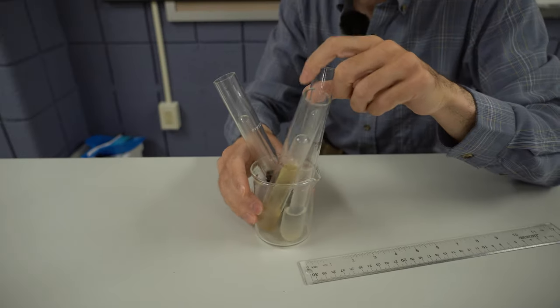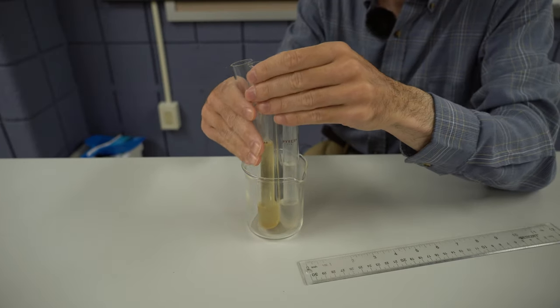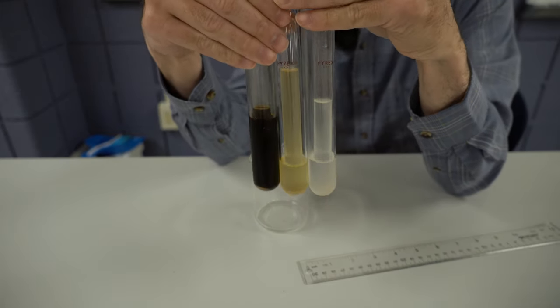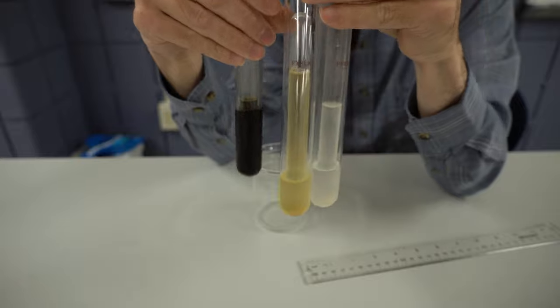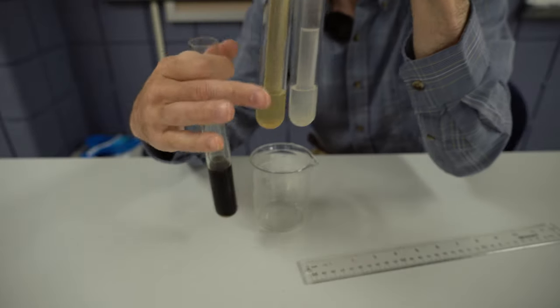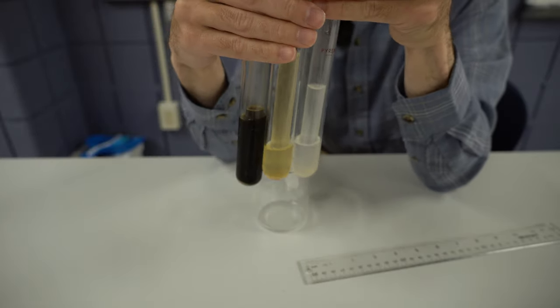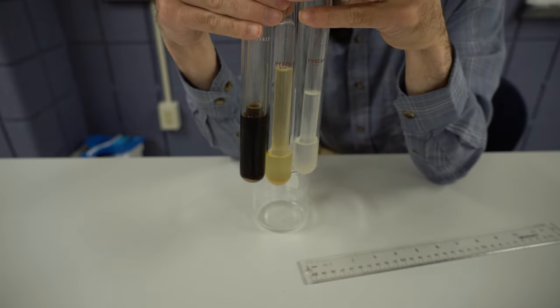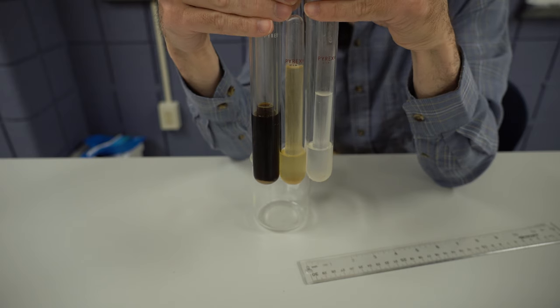So now we've given our yeast some time to grow, and there are various sugar solutions. And we can see there's varying degrees of happiness going on. We have the molasses, we have the honey, and we have the refined sugar, which is the clear one. And we can see that there is a difference between the amount of carbon dioxide gas produced, the amount of bubbles.